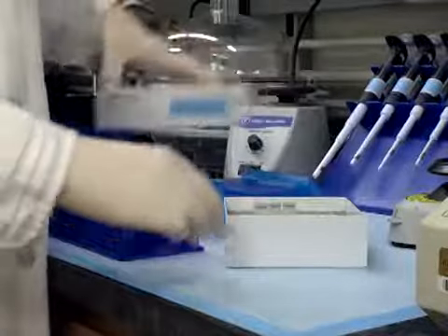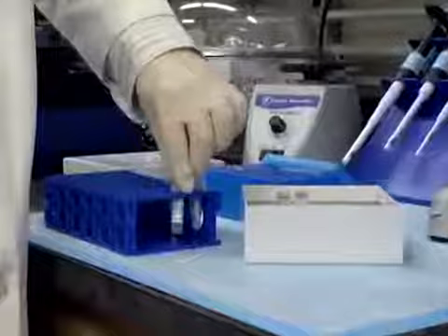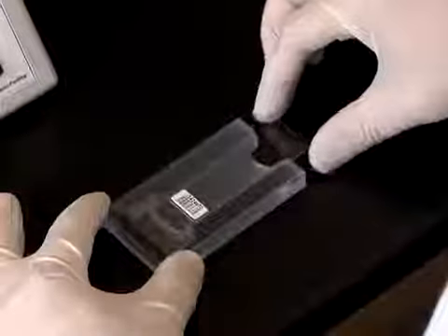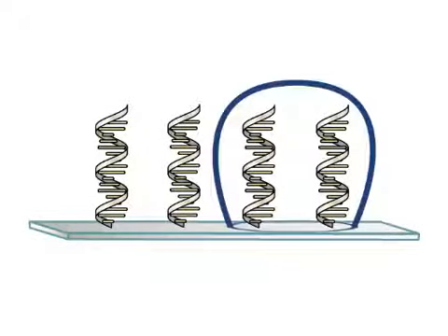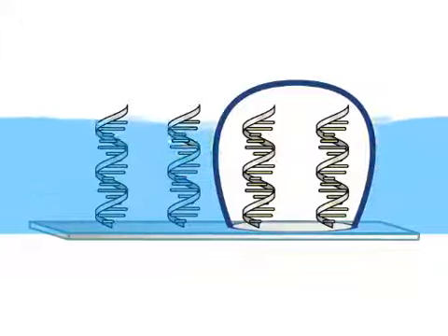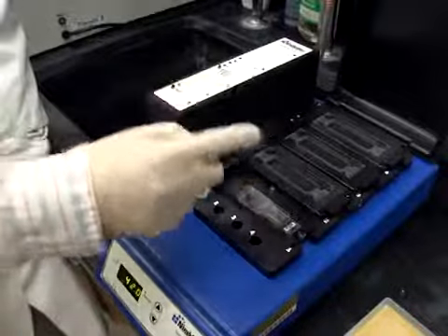The labeled cRNA is then mixed with hybridization solution before loading onto a microarray. To facilitate successful hybridization, a mixer is placed onto the chip to form hybridization chambers. The hybridization mix is then slowly added onto the array. Care must be taken to avoid air bubbles, as these can interfere with the binding of the sample to specific regions on the microarray and result in a false negative signal. Once the sample is added, chips are incubated at the appropriate temperature for up to 24 hours.